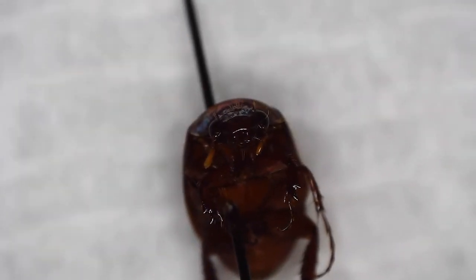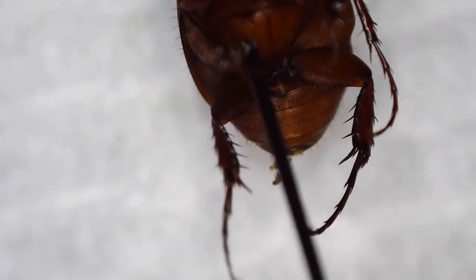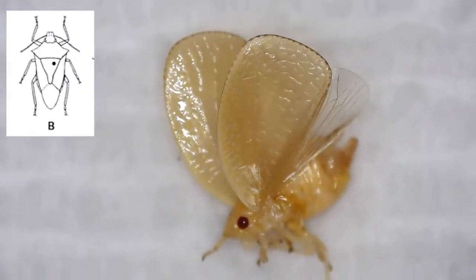This is a scarab belonging to the family Scarabaeidae. And just as a reminder, beetles belong to the order Coleoptera. But you can see some features there, lots of spines on those legs. Now we'll move on to our next insect.